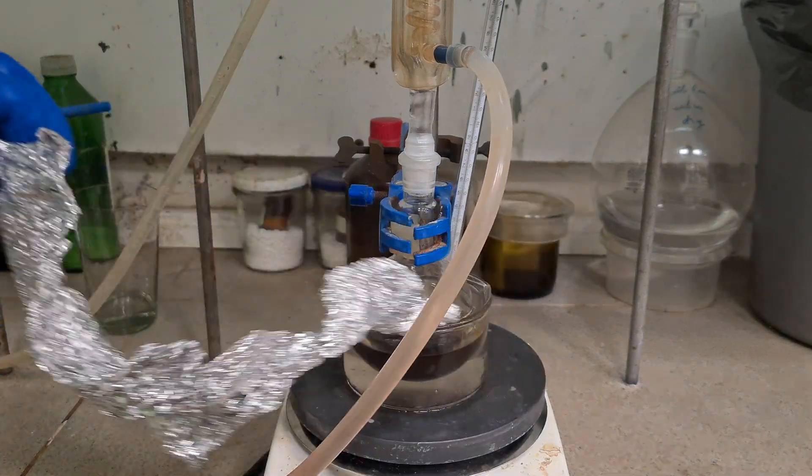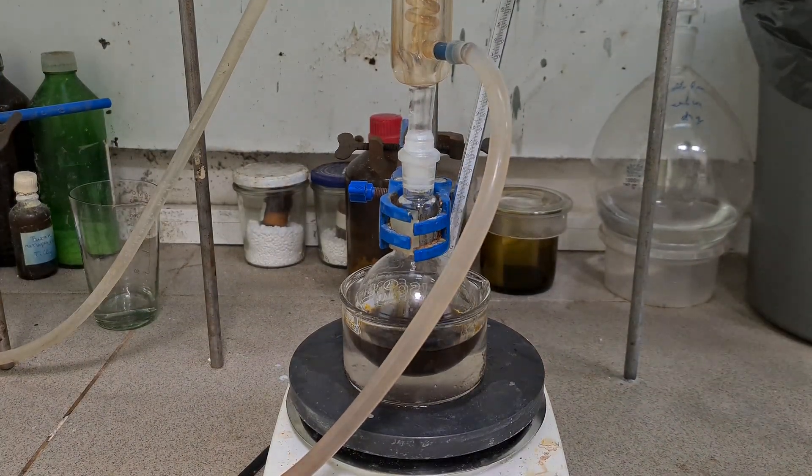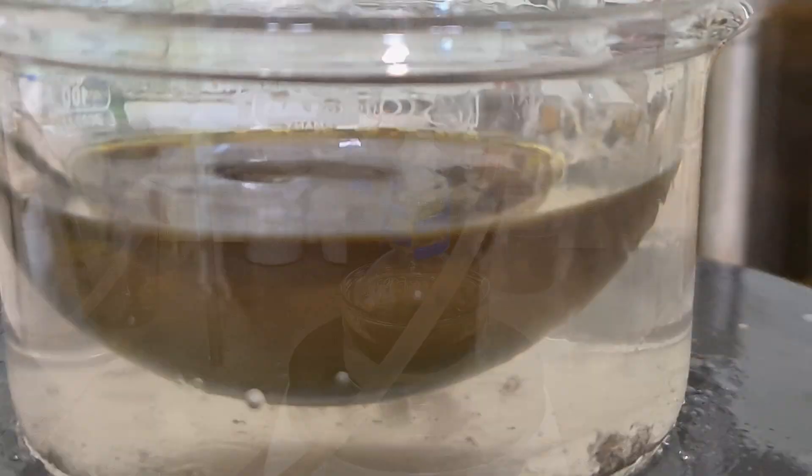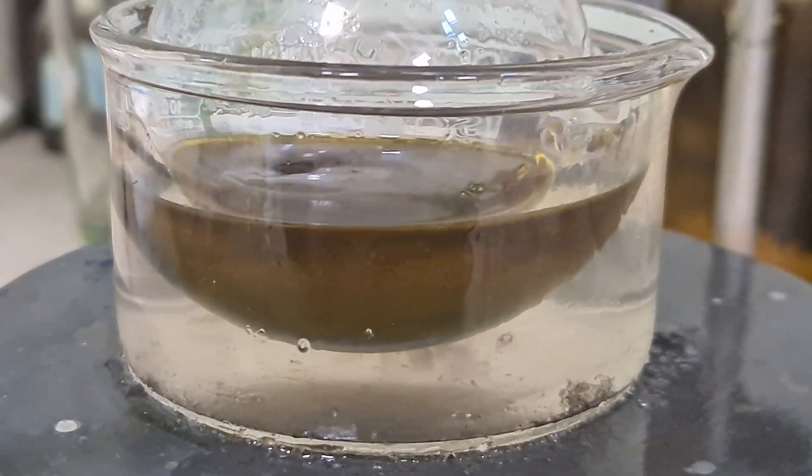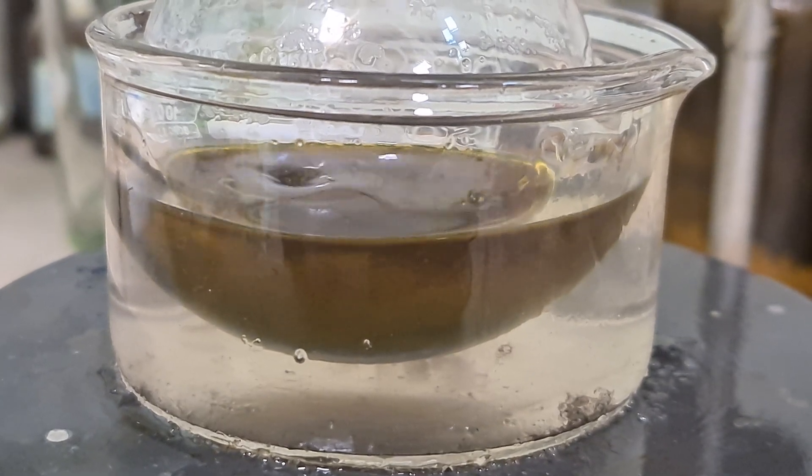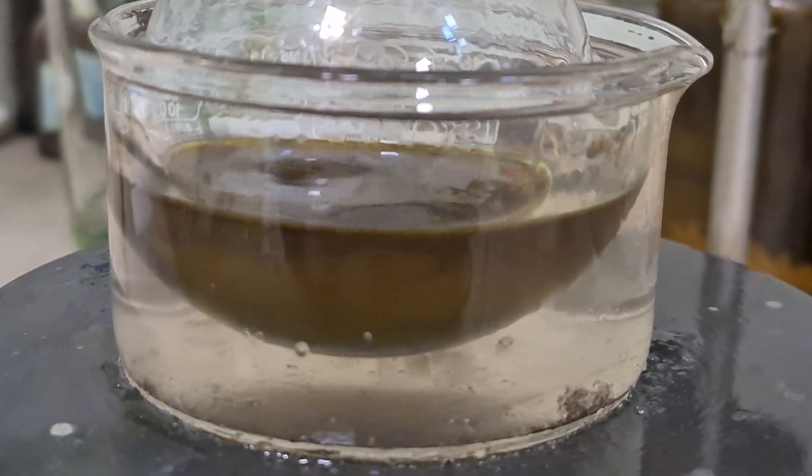After reaction completion, just uncover the flask and let it cool down to room temperature. As you can see, bis-precipitate is coming out. It's a nice shiny powder. Now let our reaction mixture store overnight.